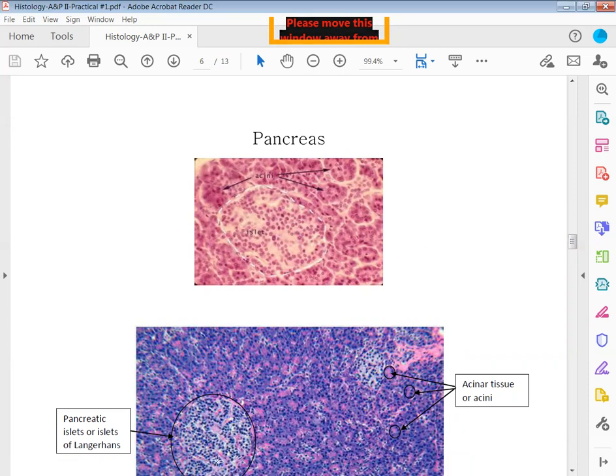Then outside of this light blob, you have these groups of cells that almost look hot pink in the center, and then they have a blue outline. Each one of these is called your acini or acinar tissue. So here, these are your acini, or your acinar tissues.